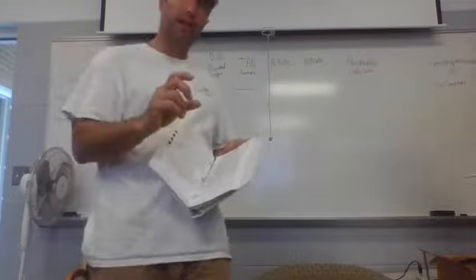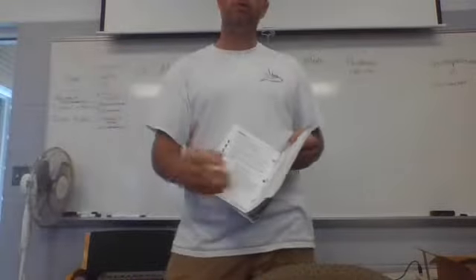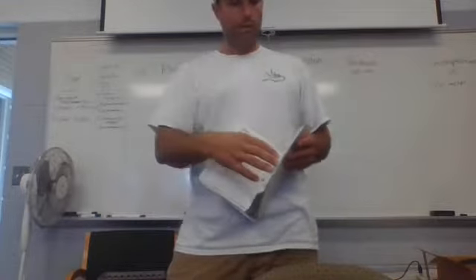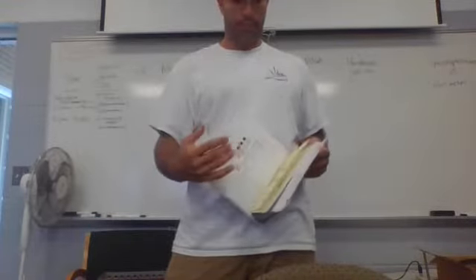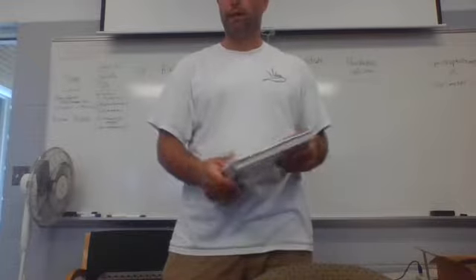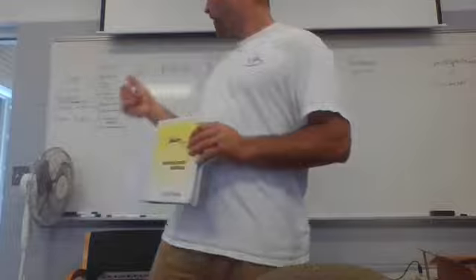And so they usually have a range that they're effective, where if it's outside of that test range, it'll be too dark to measure or too light to get a good reading. But there's literally just, this is a small book. There's larger books for some of the other tests for spectrophotometer. So spectrophotometer is the answer for a lot of these.